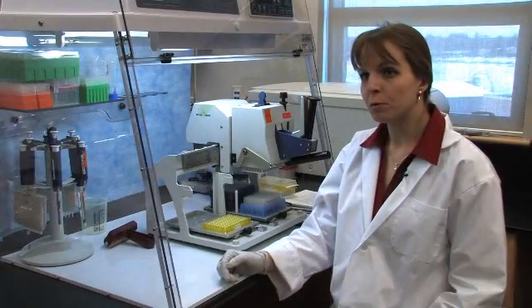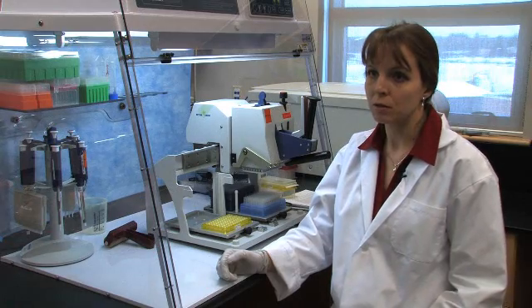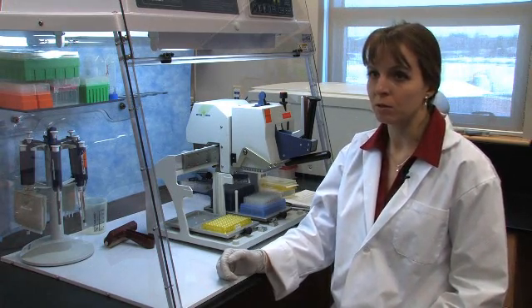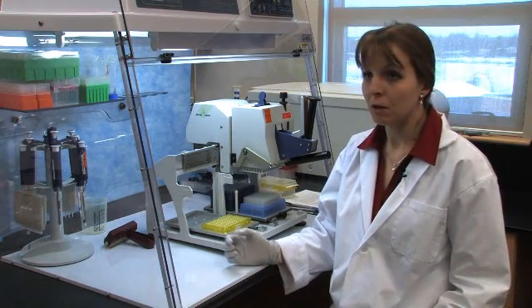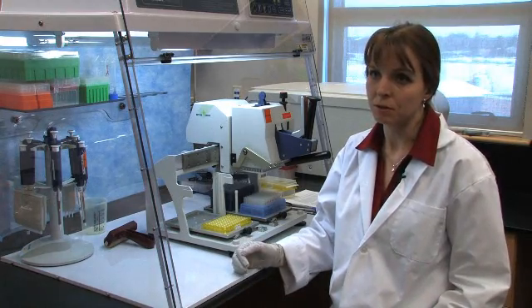We work with really small volumes. Our reaction volume slightly exceeds 10 microliters. For PCR, the total volume is 12.5 microliters. All that is added is DNA. The Liquidator allows us to handle small volumes easily, both for PCR and for cycle sequencing setup.